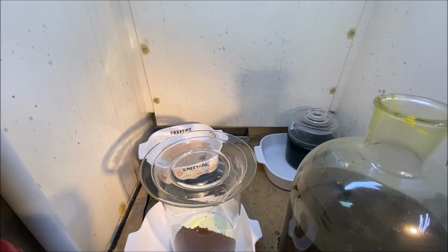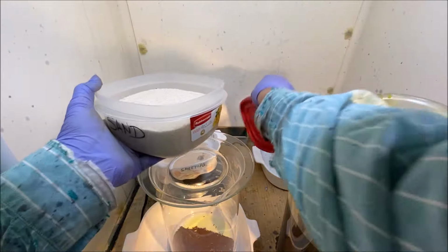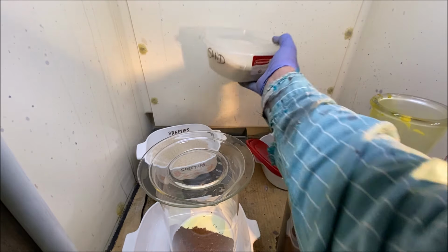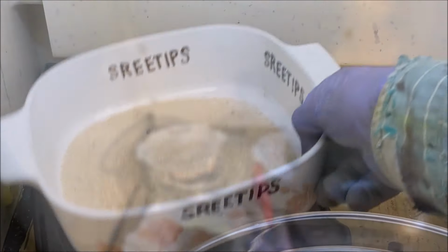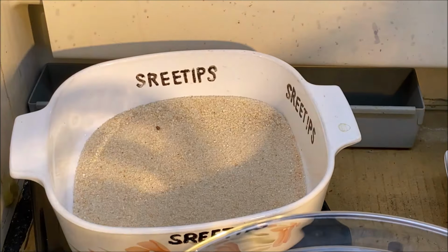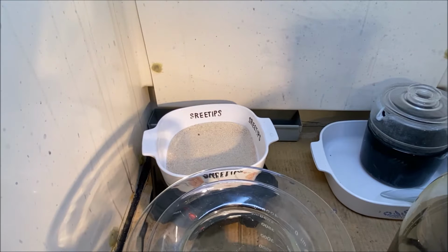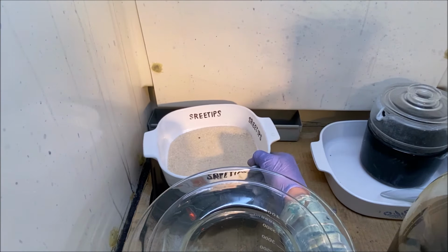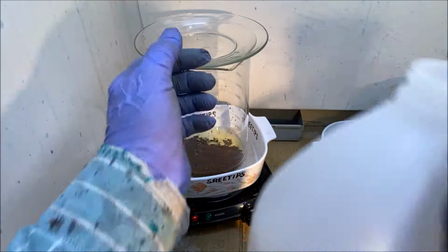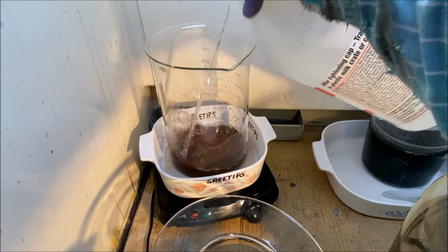Now we're going to give this a boil in some hydrochloric acid, but before I do that, I'm going to add a little bit more sand to my dish back here. So I got a decent layer of sand going on in there. See, there's a thicker layer of sand that should help me prevent any steam bubbles that I might experience when I have the heat turned up to boil these solutions. I'm adding some hydrochloric acid, and we're going to give this a boil in hydrochloric acid.